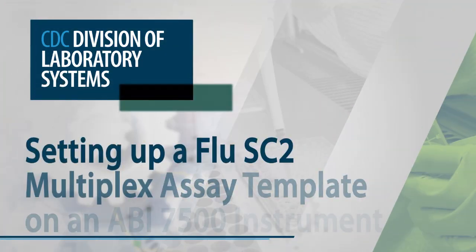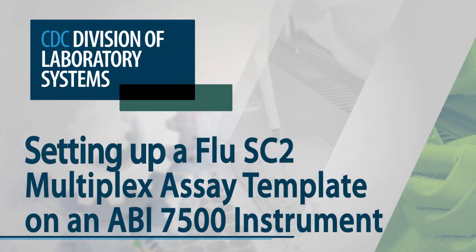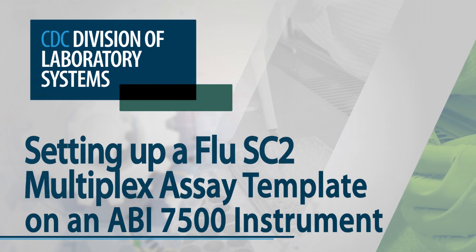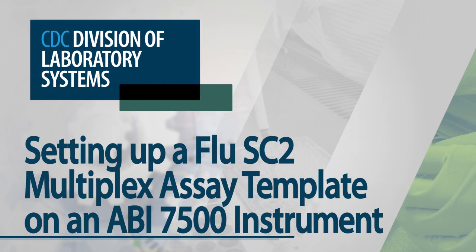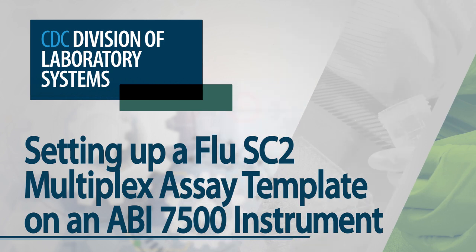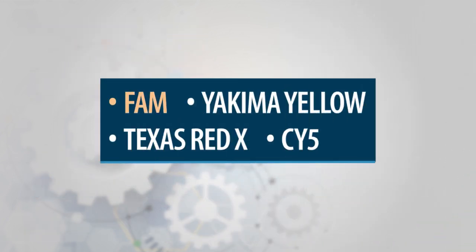This video will demonstrate how to set up the CDC Flu SC2 Multiplex Assay Template on an Applied Biosystems 7500 Fast DX Real-Time PCR Instrument using the optimal filter calibrations of FAM, Yakima Yellow, Texas Red X, and CY5.